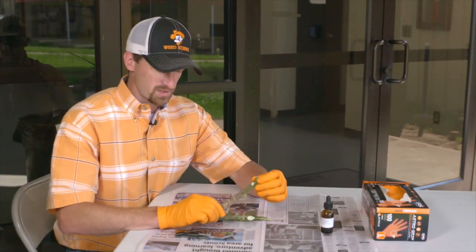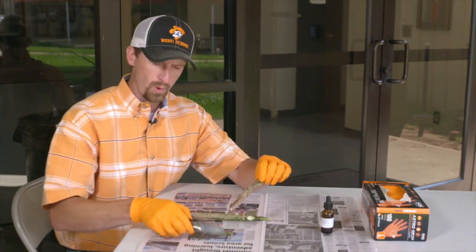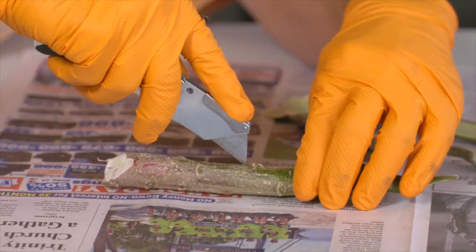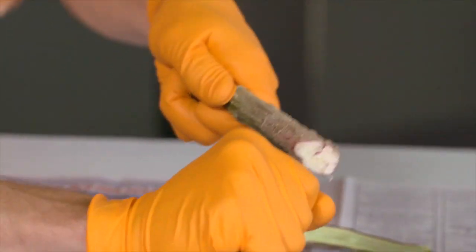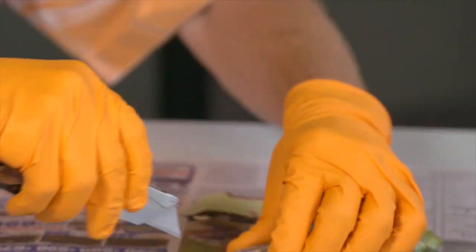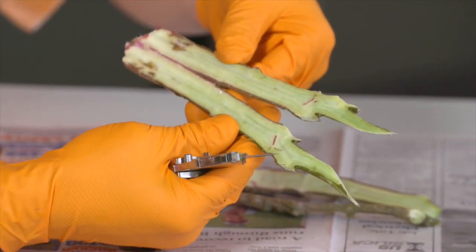Now we're ready to split a couple of these stems, and I'm going to show you the proper way to do that with your knife. One of the safest and easiest ways is to insert the blade into the stem, then pick that stem up and move the knife away from you to split it. You can alternate the stem around and move your knife the other way, ending up with a really nice split stem without cutting towards yourself.